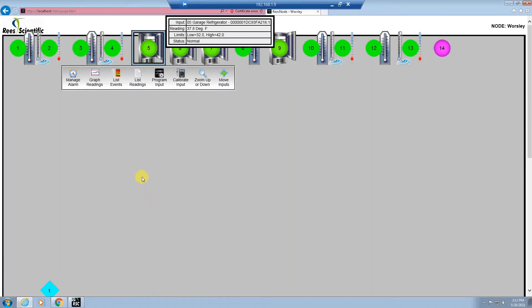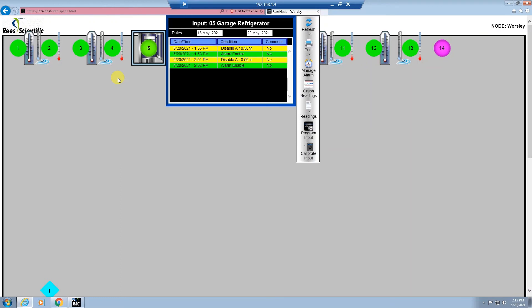The list events report will allow you to print a report of any event that has been recorded with this input. After selecting the input and selecting list events, you can change the date range to get either more or less information for your report. You can hit print list and it will open up in a new tab, and you can print by either going to Control+P and selecting your printer or PDF, or doing file and print.